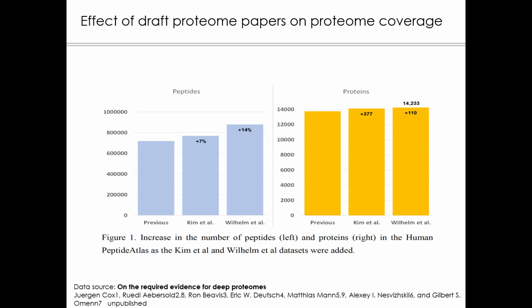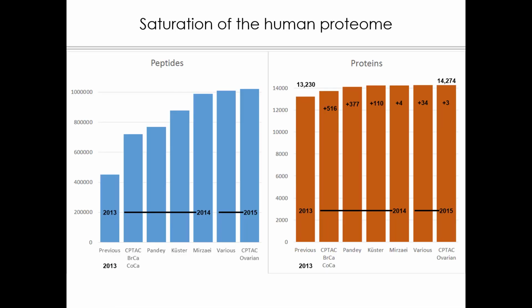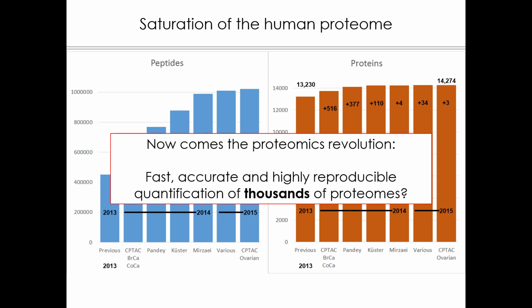And then this was eventually rejected as no longer interesting, because the editor said the papers were published a while ago. It took about 2 years to actually do this reanalysis, and they eventually said it was no longer interesting. But it is interesting, because there are now 5,000 or so proteins in the literature which are claimed to have been identified by mass spectrometry, and we think they're not. So someone will now use this data and make claims, and things propagate in the literature, but Nature was not willing to consider this seriously. Okay, so that much to the effect of coverage.